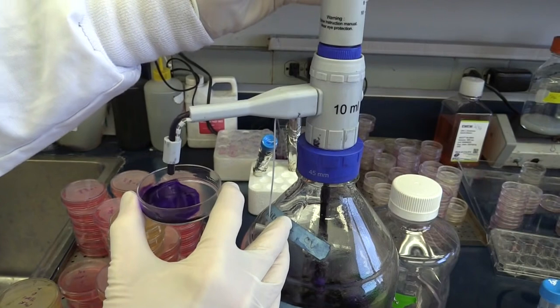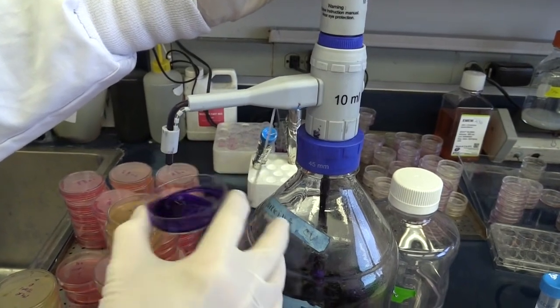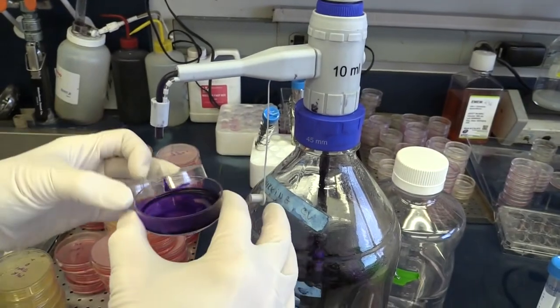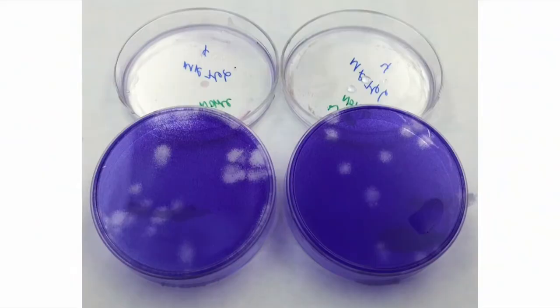Finally, we add a dye to the cells, and we use a vital dye called crystal violet, which stains living cells. The plaques are then visible as clearings against a purple background, clearings where the virus has killed off all the cells. Calculating the virus titer is easy.